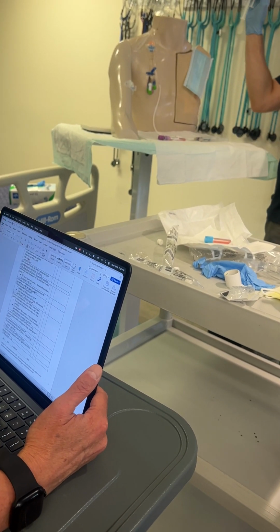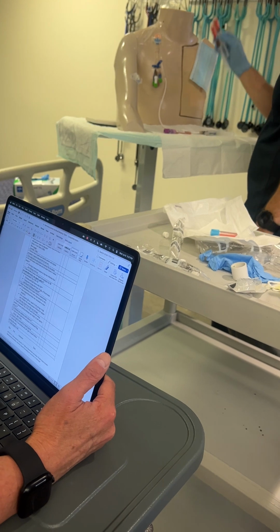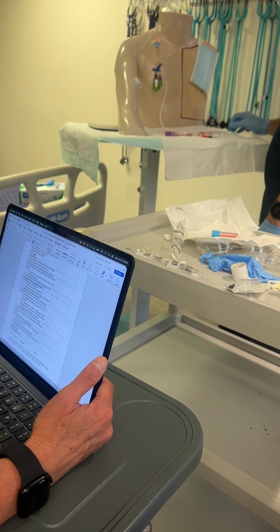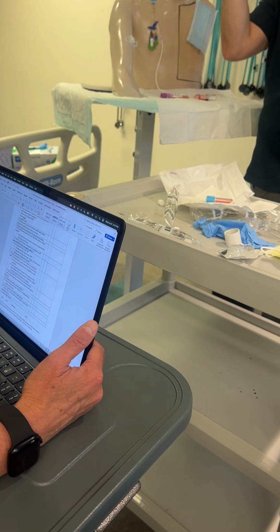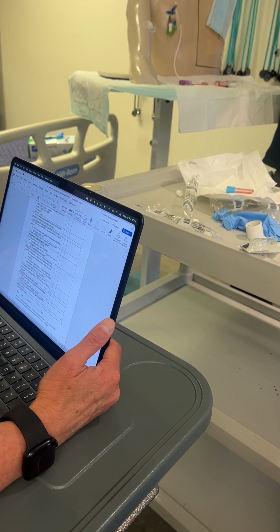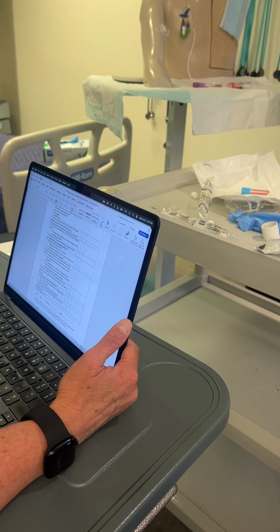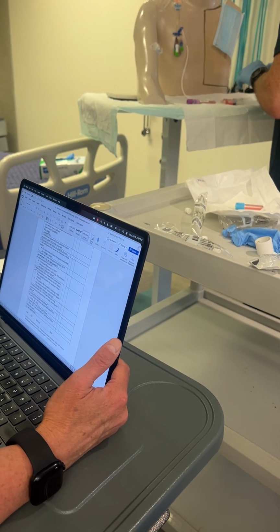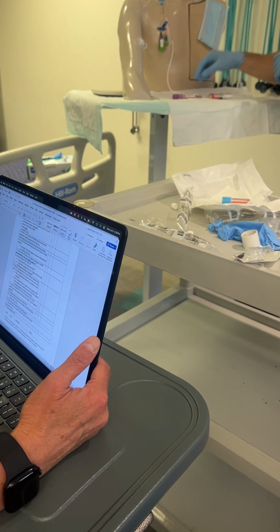These can go in biohazard, right? We don't really want to get in the habit of putting these in sharps. This can go in the garbage. Where does this go? In the sharps. Why? Because that's a needle. Yeah, and this, if you put your finger in here, there's a needle right there, right? So some people forget about that. So yeah, definitely sharps.